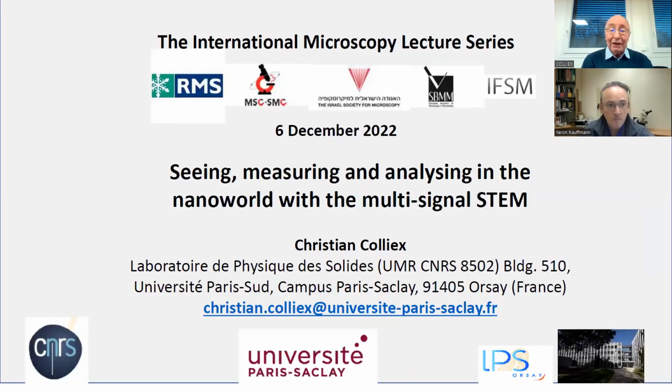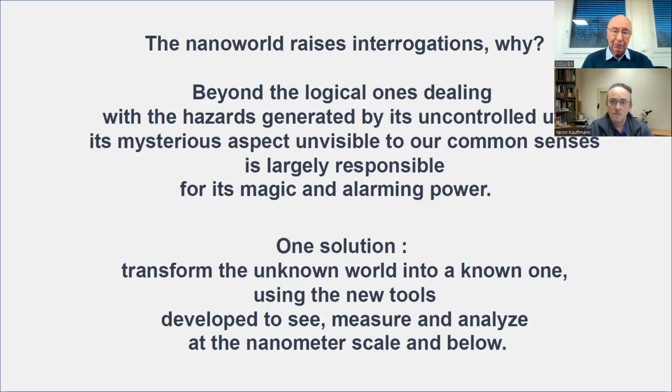Okay, so I have chosen tonight for my presentation to speak of the nanoworld. The nanoworld, which we want to see, to measure, to analyze. And for that, we have developed here in Orsay a multi-signal scanning transmission electron microscope. So why the nanoworld? Because the nanoworld raises many interrogations.